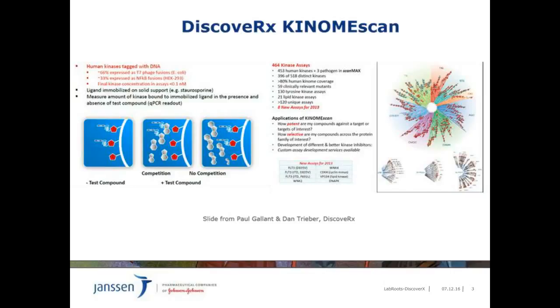KinomeScan is a competitive binding assay which allows the determination of KDs after correction. The assay uses affinity beads to immobilize DNA-tagged target kinases, which are displaced by the test compound in a dose-dependent manner. The kinase concentration is then measured using a qPCR reaction. The assay allows some multiplexing and is available for more than 400 wild-type kinases and mutants.